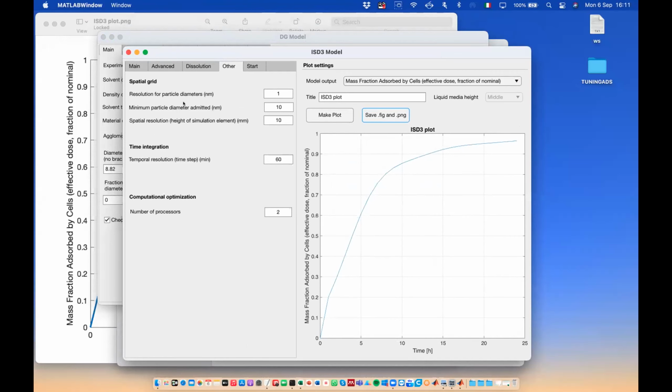The stickiness was best for a given nanoparticle. Could you briefly comment on how to predict it? Well, in our hands, a good stickiness level is a medium stickiness, but we did see that barium sulfate was more sticky, almost maximally sticky.